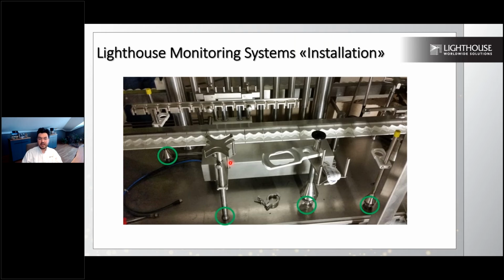And I have these active and passive Petri dish holders where I will be maintaining them during production without having my gloves over the line and over the particle counters. That's why I have a very suitable location for this. While the operator is making necessary changes, they're not putting their gloves on top of the production line, the open products, as well as not on top of the particle counters.